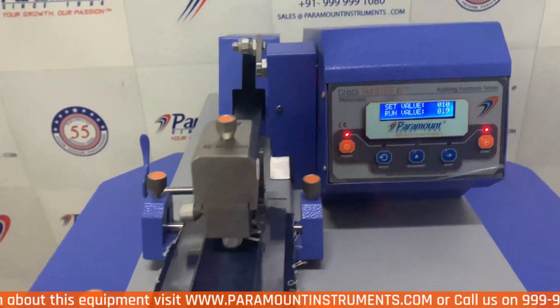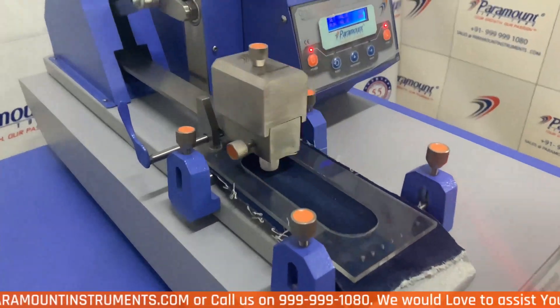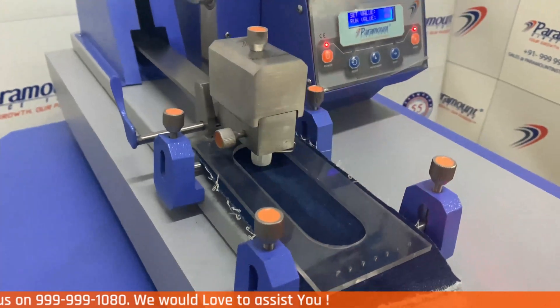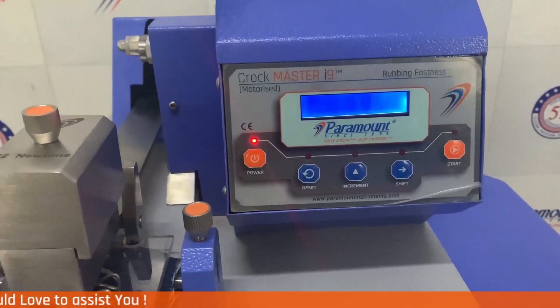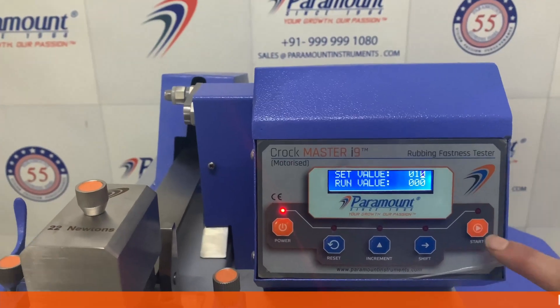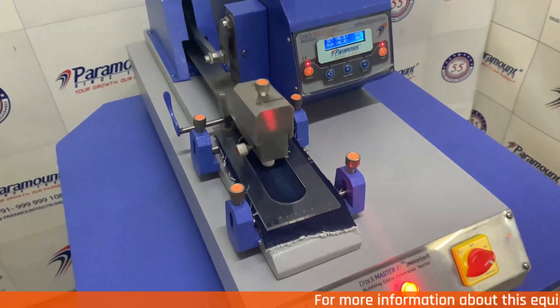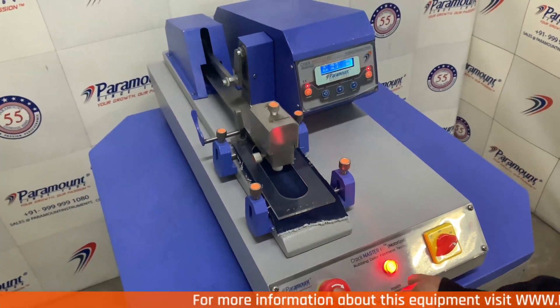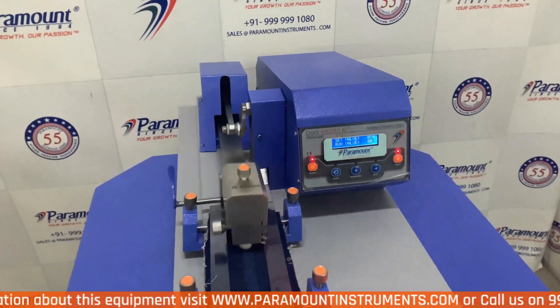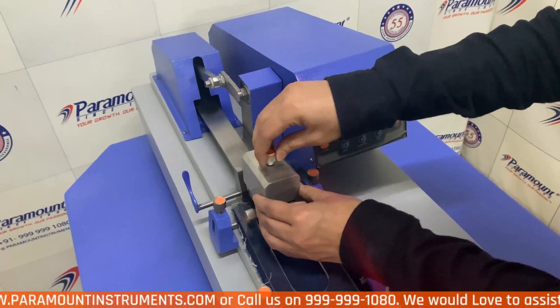After pressing the start button the test will start. And after completion you will get a test finished message, to let you know that the test has been conducted. In case of an emergency, you can use the emergency start-stop switch and the test will stop at the exact moment. And after rotating the emergency button, the test will start from the exact same position and will give you the correct readings.